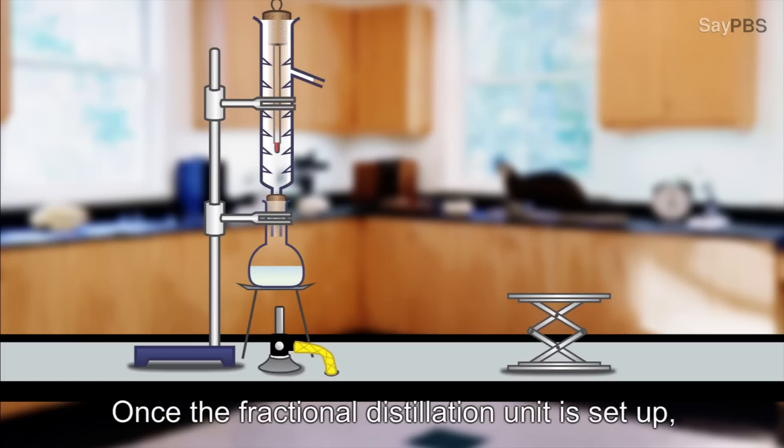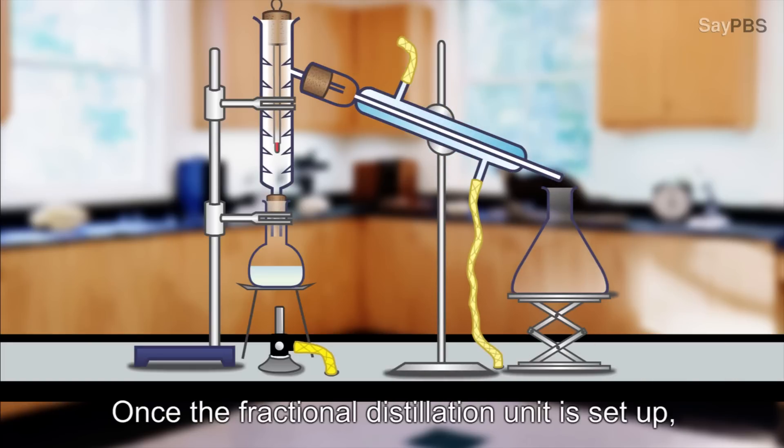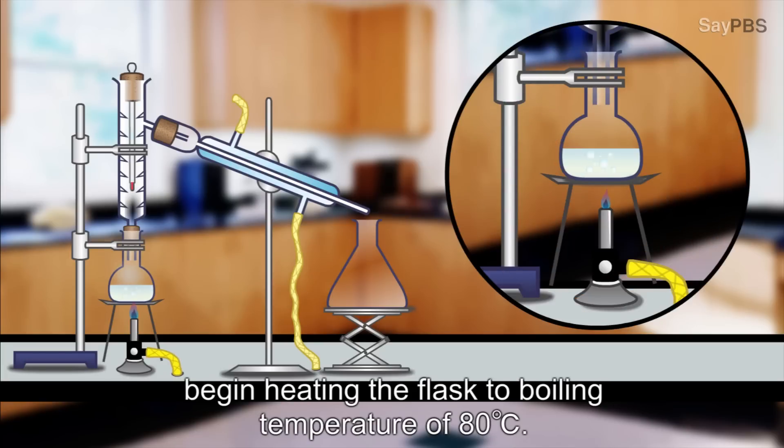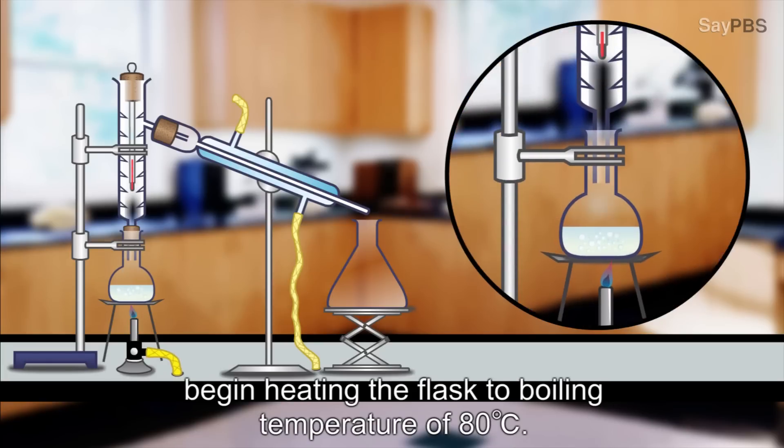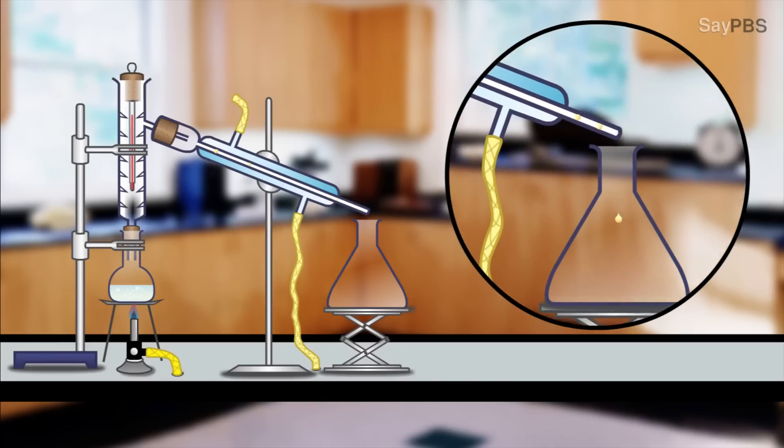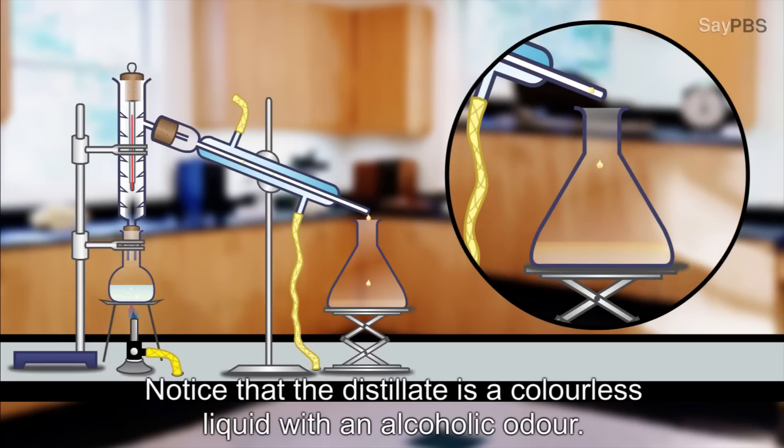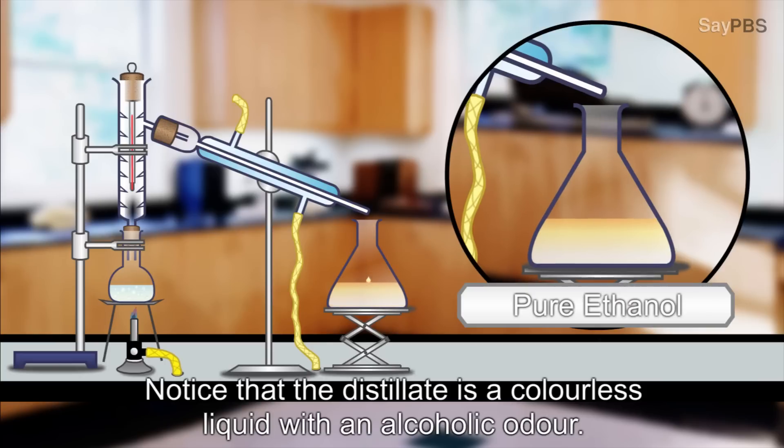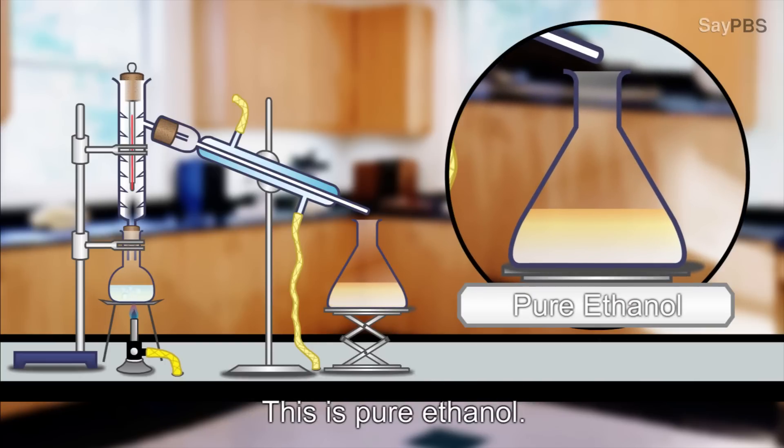Once the fractional distillation unit is set up, begin heating the flask to boiling temperature of 80 degrees Celsius. The distillate is then collected in the flask. Notice that the distillate is a colorless liquid with an alcoholic odor. This is pure ethanol.